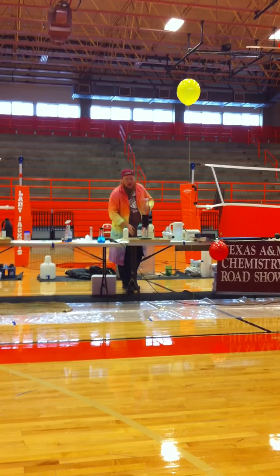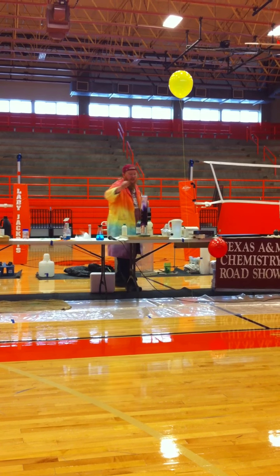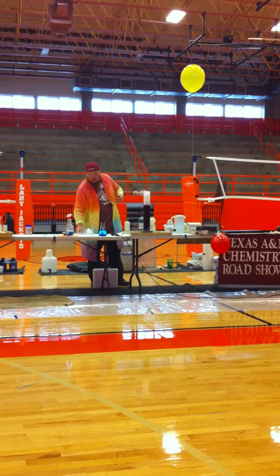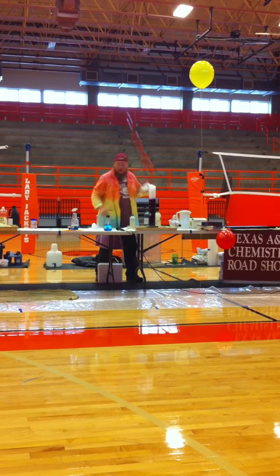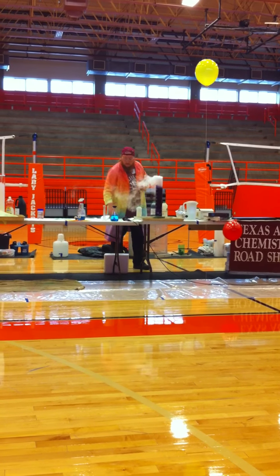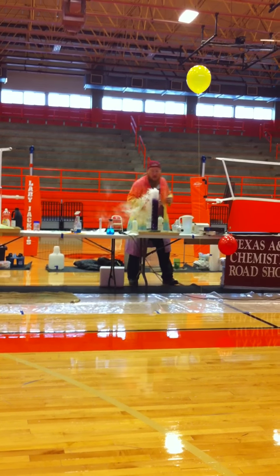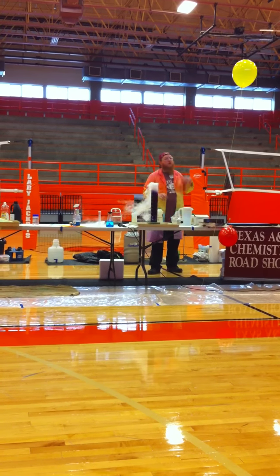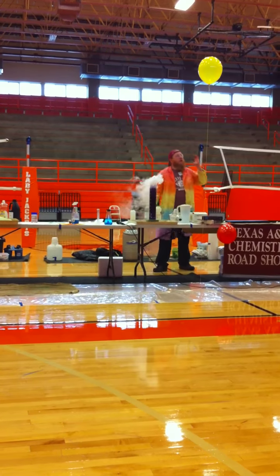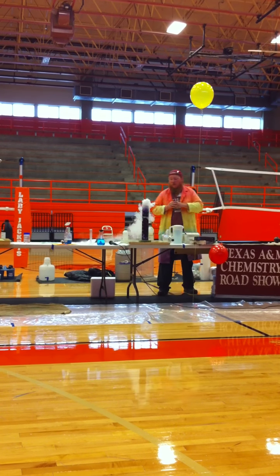Now, when I add the dry ice, carbon dioxide reacts with water to make carbonic acid. That's one of the reasons why carbonated sodas are slightly acidic, because of the carbonic acid from the carbonation. Now what should happen is, in addition to being a nice cool chemistry looking demonstration, as that carbonic acid forms, it's going to neutralize the base, and so this should go from purple to blue to green to yellow. If we made it really, really acidic, it would actually go red, but it won't get quite that acidic.